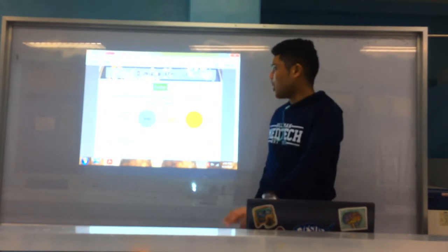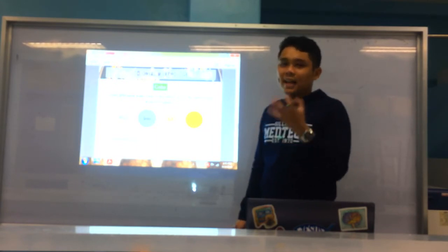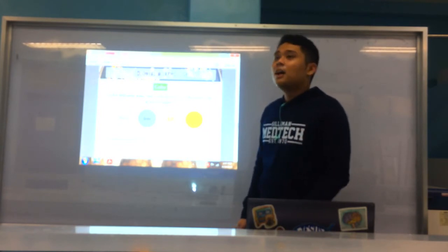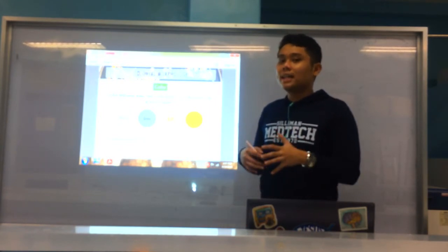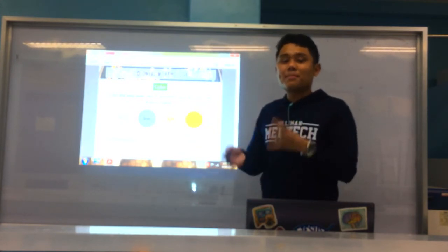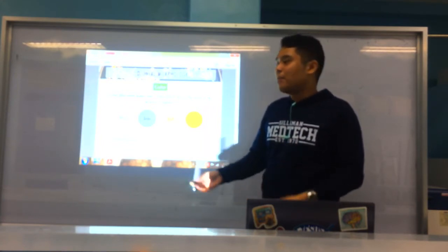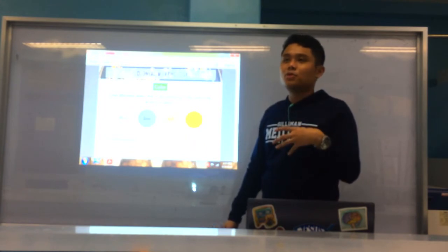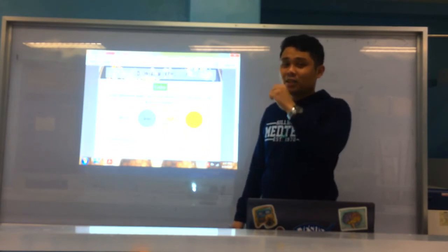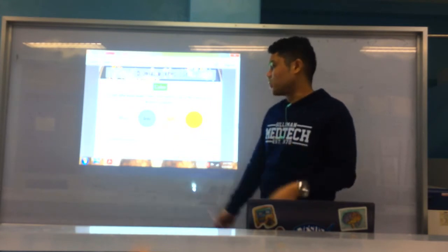Okay? All right. For color again, usually if non-differential media nimo, example like mga nutrient agar, mga katulad yung basic na mga media, non-differential. If na color na ma-produce, you can really say that it's the bacteria's pigments ang ga-produce, right? It's the presence of the pigments of the bacteria, meaning it's innate to the bacteria to really produce pigments or color, okay? But if na siya sa differential media, example, MAC, you have XLD, mga inana. If na ay color sa colonies, it's because of their metabolic processes and also the presence of pH indicators.